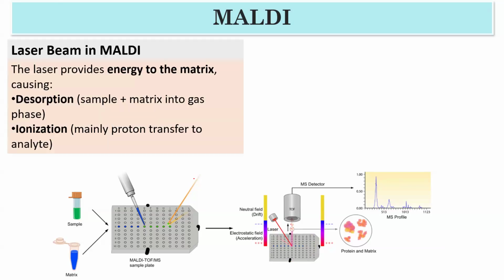So how does it work? We use a laser beam in MALDI. The laser will provide energy to the matrix. What will happen by that? Desorption will happen. That means your molecules and your matrix will dissolve from this surface, go into gaseous form, and also ionize.